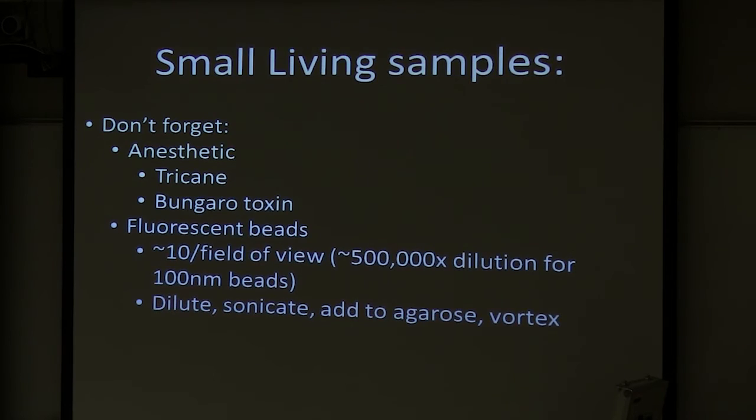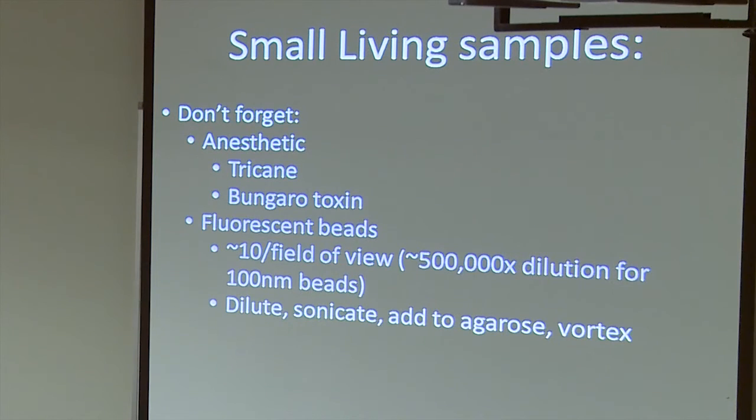That's the quickest way to do it. So you're going to dilute those beads, sonicate them to break them up because they're usually in little clumps, add them to your agarose and vortex them really well before you put your sample into it.